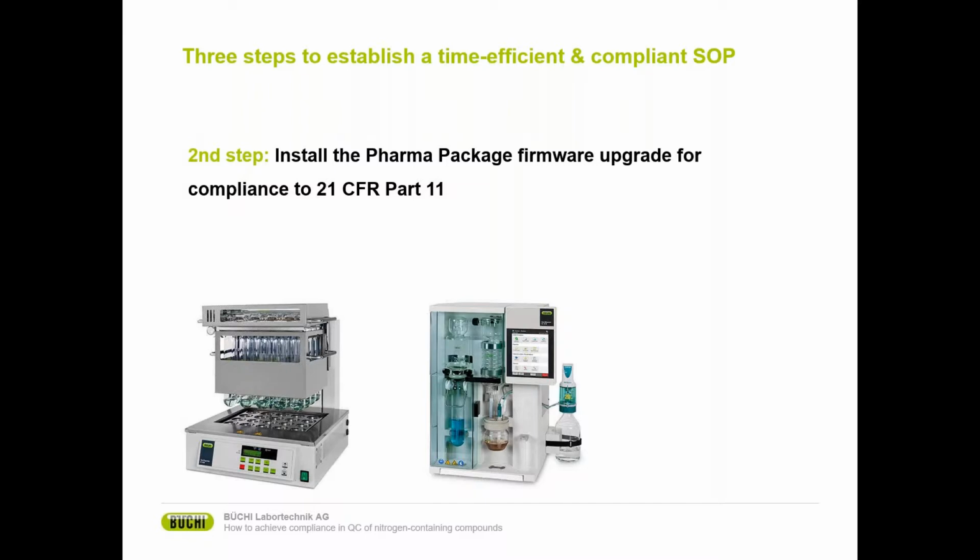The second step is more about compliance to 21 CFR Part 11. As you remember, I just mentioned all of these features, and they are packed into the pharma package firmware upgrade for the distillation unit. So the second step is just to install the pharma package firmware upgrade, and you will have compliance to 21 CFR Part 11.